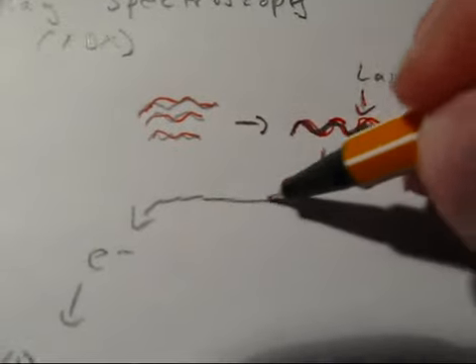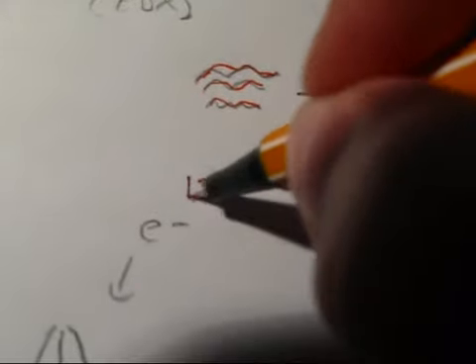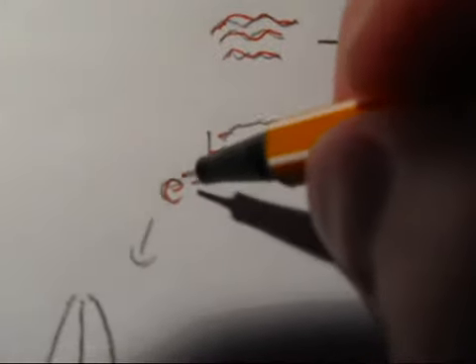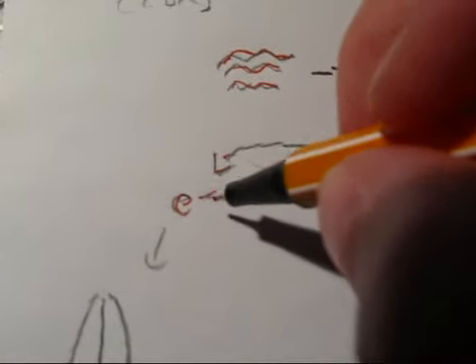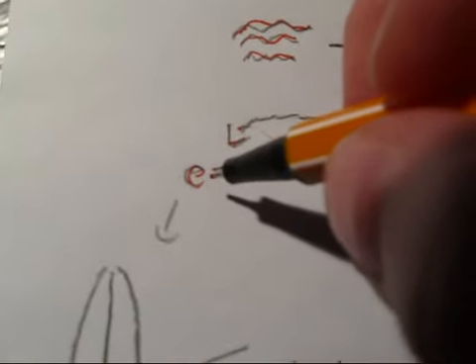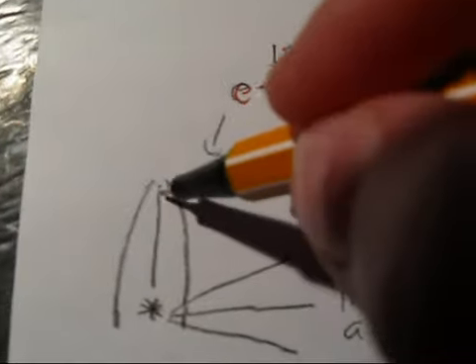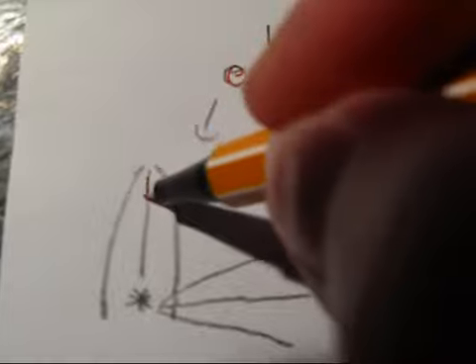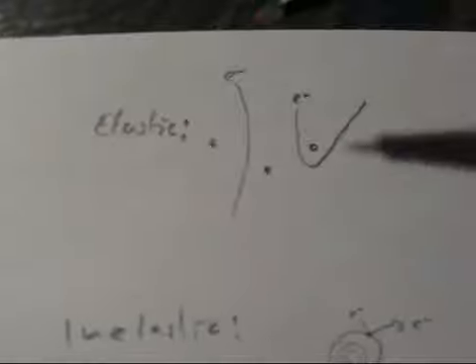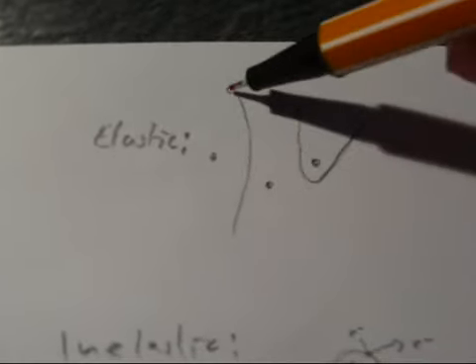And we need sort of the same thing for the electron beam in the electron microscope. We need a monochromatic electron beam that has just the same energy of electrons, so like about 20 kilovolts or something. And that's what happens within the electron microscope. So you've got that monochromatic beam of electrons coming in to the sample and interacting with it. So as I said, stuff happens with the electrons.